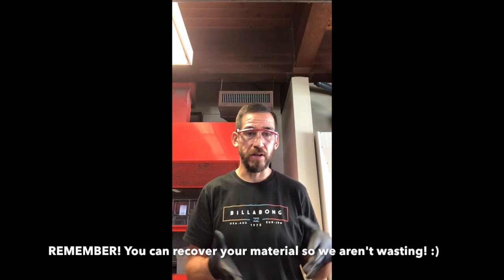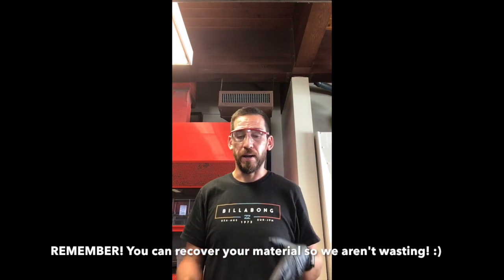Now, obviously, you're not going to be able to do this like the way I did, but instead of ethanol and caffeine, you're going to be using water and sugar, or water and salt, and you're going to have to do it on the stove. And I guess technically you could probably do it with a microwave if you didn't have a stove.